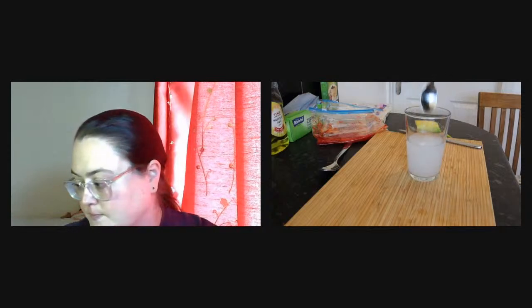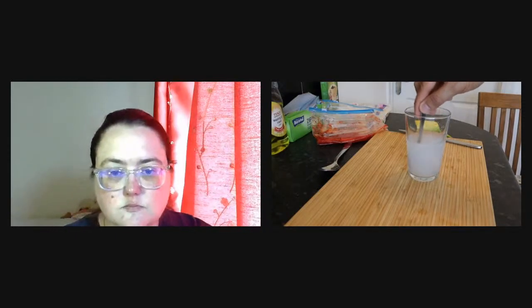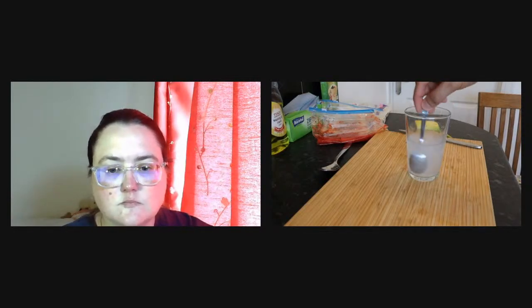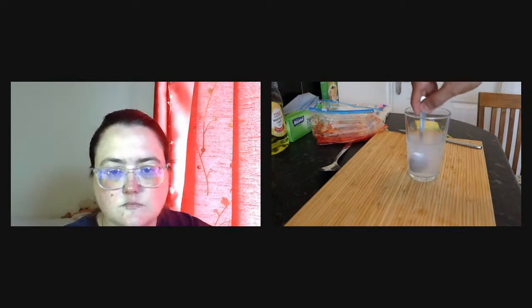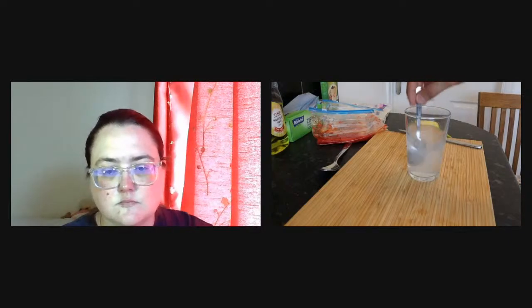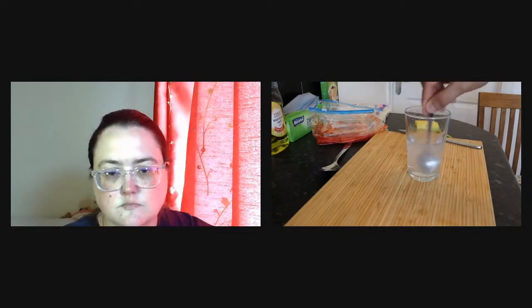Yes, thank you, Claire. So you can see at the moment that salt is still not dissolved. So we can see it. That is the white substance, and slowly it's going to go in solution and it will not be seen anymore. I'm just mixing it with a small spoon, it's fine. So very slowly we have the salt being dissolved.